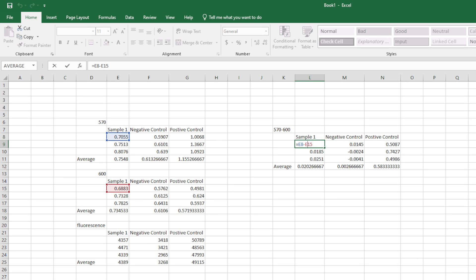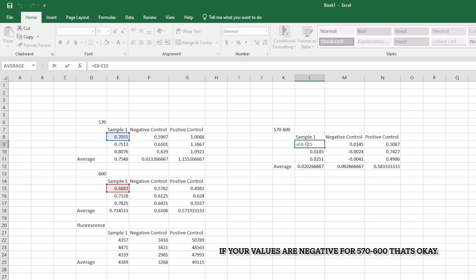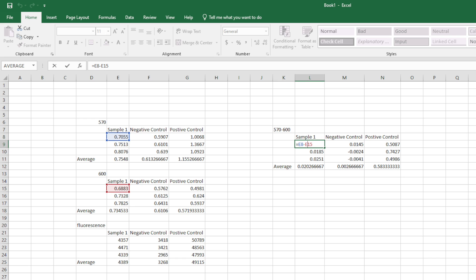So here we've added a manipulated data section where it's 570 minus 600. So the 600 is the background noise and you want to subtract that from the 570 because that's going to give you your actual reading. You're going to want to do this for the negative control, positive control, and all your samples and the averages. As you can see, the formula you can literally just make a command that can subtract it from the same well and just do this for all your data.